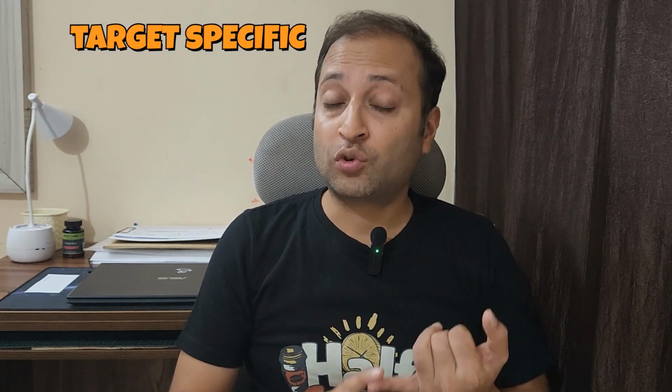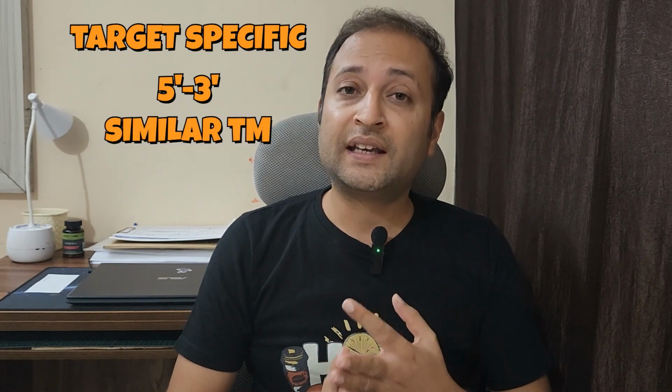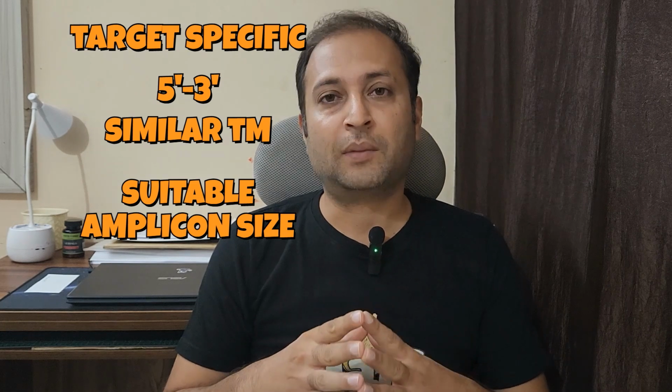Remember before ordering your primers that they are specific to your target, written in 5' to 3' direction, have similar TM values, and produce an amplicon size suitable for your experiment. And that's the complete basic workflow for designing PCR primers.